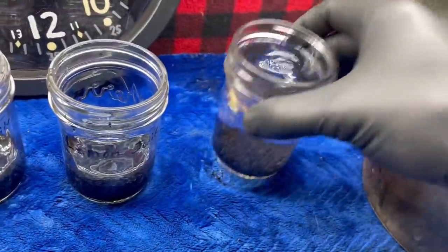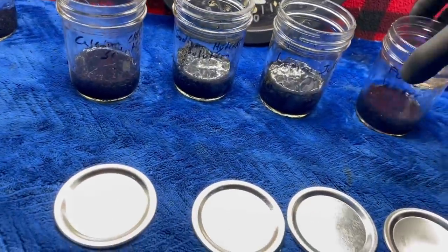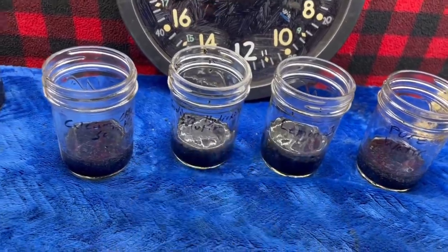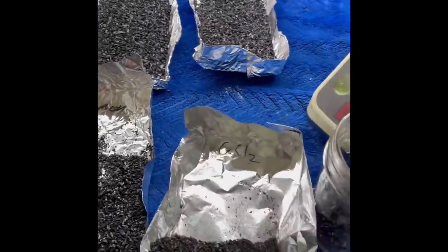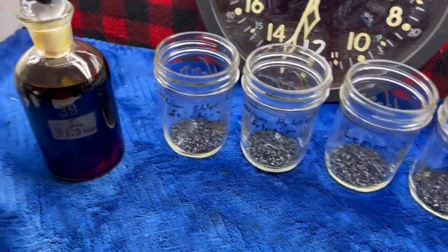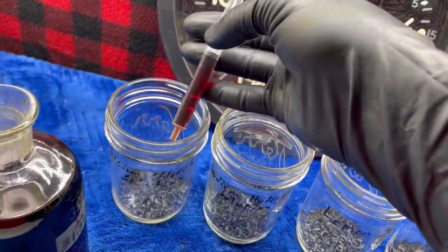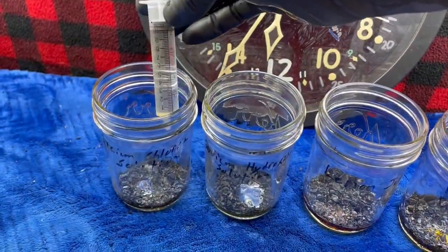I've transferred the charcoal to little dishes to dry it out so I can weigh out samples. I've weighed out one gram of each of the charcoals and put them back in the jars. Now I have my 31.5 millimolar iodine solution. I am going to add three milliliters of it to each jar of charcoal, and an additional 10 milliliters of water.